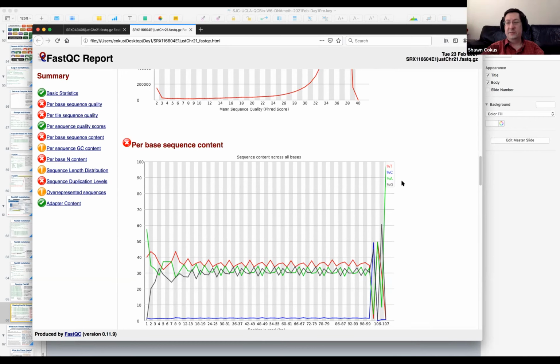And if we start cutting out 20% of reads, well, there goes 20% of our coverage, and coverage is kind of precious anyway, right? We're not really having an overabundance of coverage. I think in these libraries, the means are like 4, 5, 6, 7x for human. I don't know. It's not generous. It's not 10. It's not 20, and we're throwing data away. So we're going down. So those are the things that fight, right?